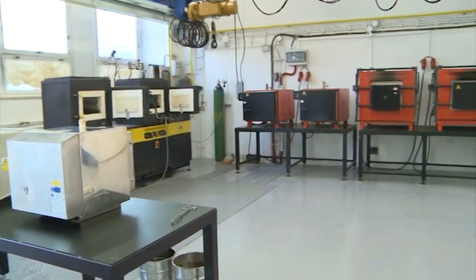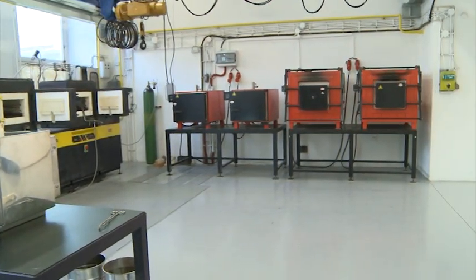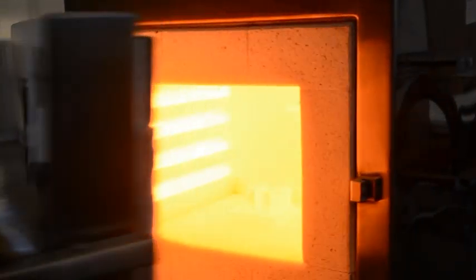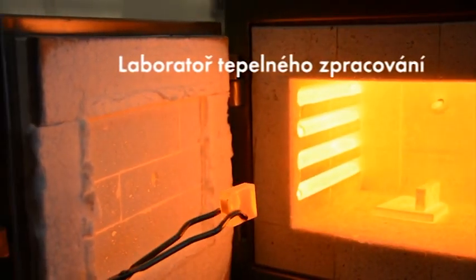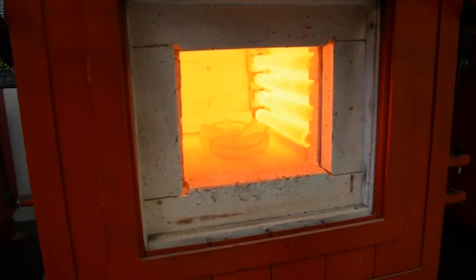Laboratoř teplného zpracování disponuje poloprovozem chemicko-tepelného zpracování, samostatnými komorovými pecemi s normální atmosférou do 1000 stupňů Celzia a pecí s možností ochrané atmosféry nebo vákua do 1100 stupňů Celzia.